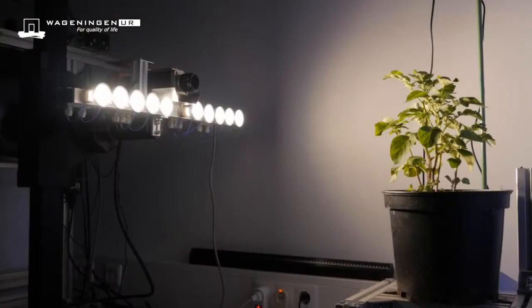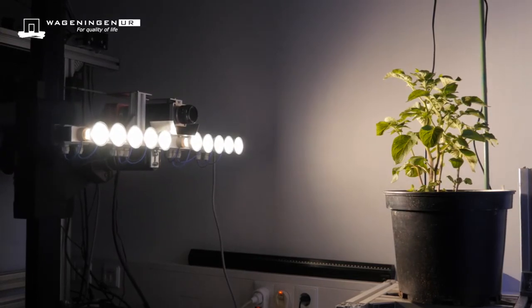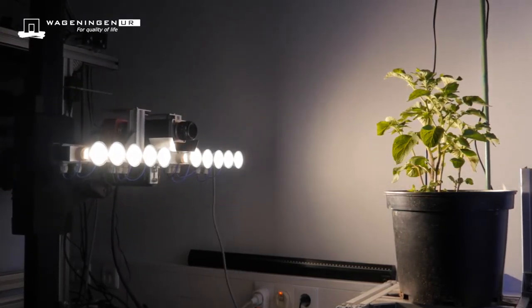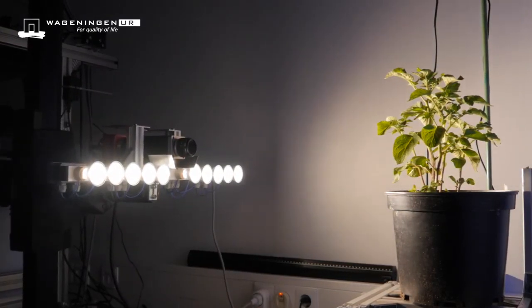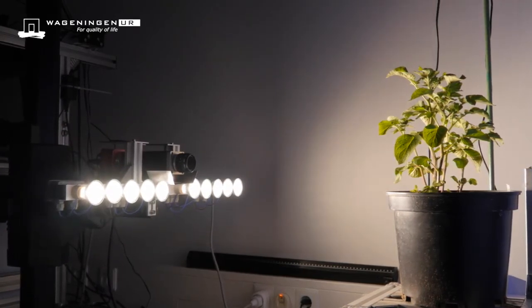The spectral power distribution of the lamp is an important factor. Our tungsten halogen light sources give a smooth and stable emission spectrum over the whole spectral range.